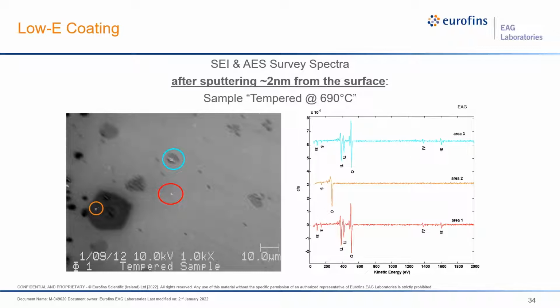But this dark area, on the other hand, is almost all carbonaceous material, maybe organic, maybe graphitic, but the Auger will not be able to tell us that, as well as other techniques, if it is a polymer-like contaminant.